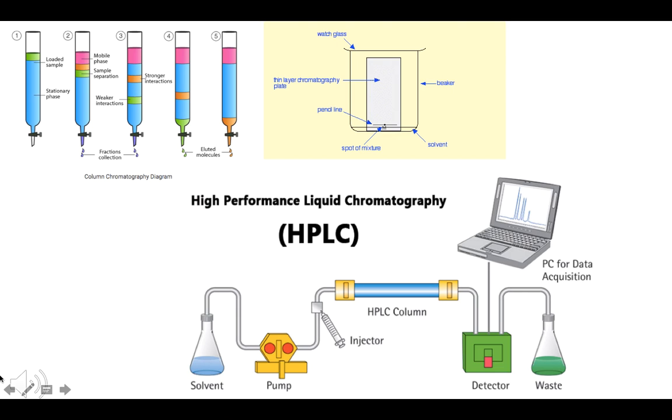It's going to stay longer because it's going to touch the stationary phase, the solid TLC plate, and not want to leave. But the non-polar component will have a low affinity for the adsorbent because it's not attracted to it, so it'll be repelled from it. It'll have a high migration rate. So the non-polar will be faster and leave faster. It'll be found higher on the TLC plate.